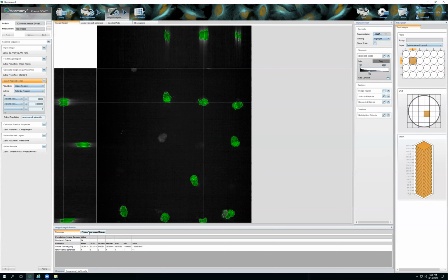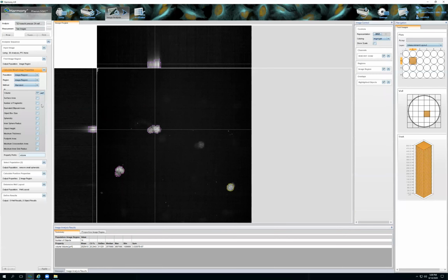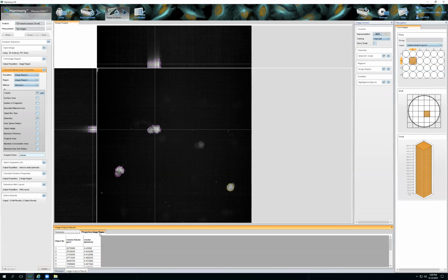And again, this goes back to this tab down here, where you can specifically look at your blobs and set cutoffs as you wish. If there's debris in there, these are kind of blobby or circular, but say you had things that were lines. Mine are pretty close for sphericity, but if you had a piece of debris that was a line, the sphericity number, for example, would be completely different. So you can set a cutoff in your select population tab.